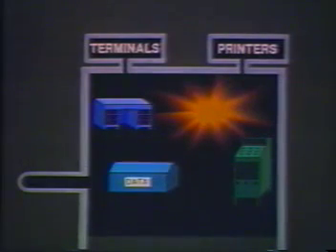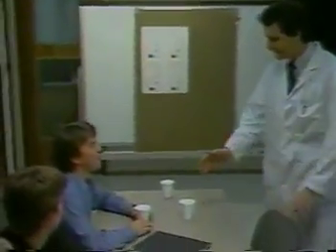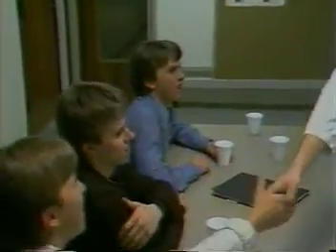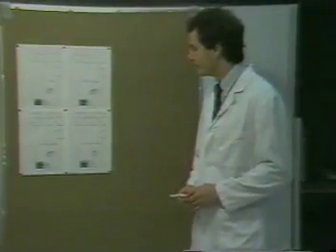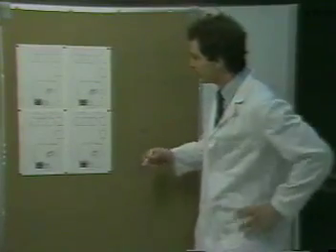Dr. Thomas Kipps from the Genetics Department of Stanford University has allowed us to document a multi-parameter FACS experiment that he is running at the BDIS laboratories. The experiment is part of a study examining the genetic mechanisms that control the proportions of lymphocyte subpopulations in human peripheral blood.